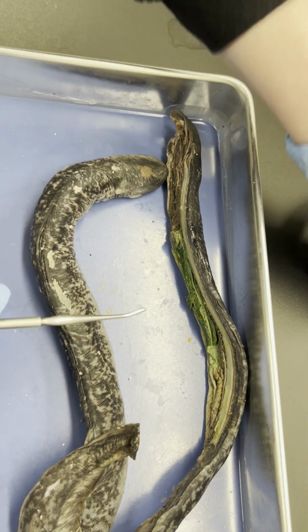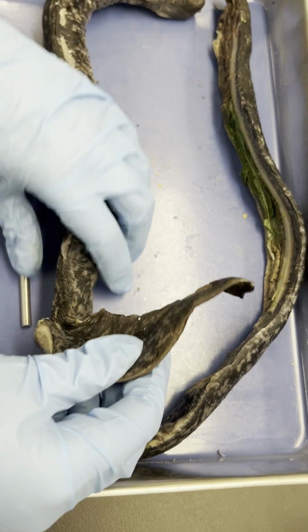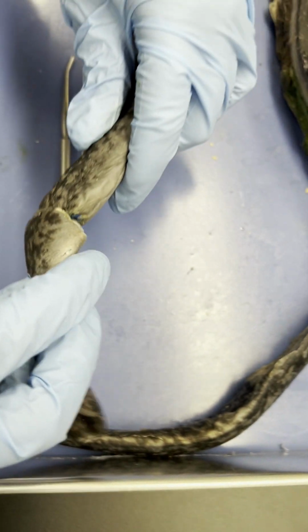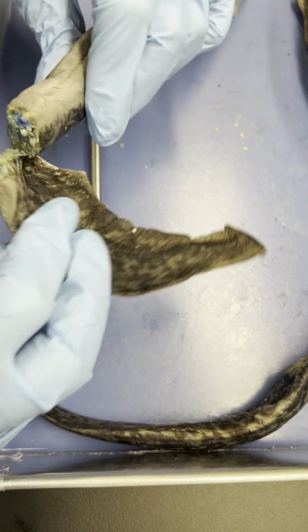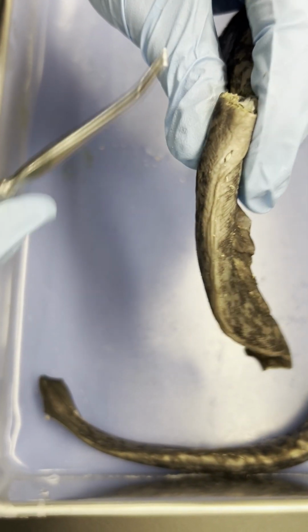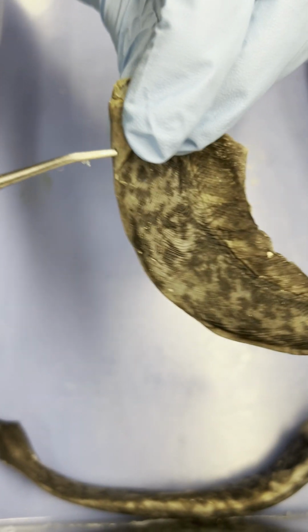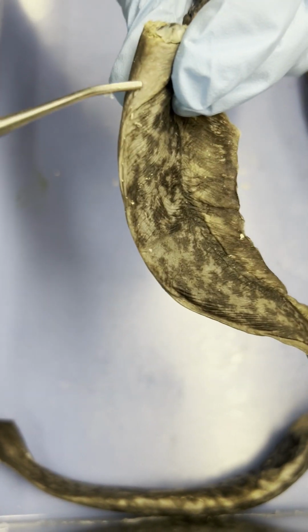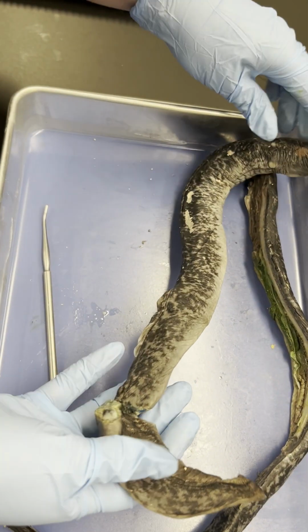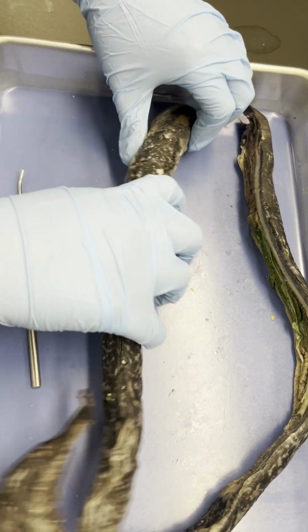And then last but not least, we cut through the tail, a cross section through the tail. Now, when the company injected these guys with dye, they already made a cross section near the tail. But when I look closely, I can see that after the spot where they made that cross section is where we have our cloaca. So I am going to cut further back past the cloaca to make my final cross section of the tail region. I hope that all makes sense. So now let's go about making our cross section cuts, and we'll see how it goes.